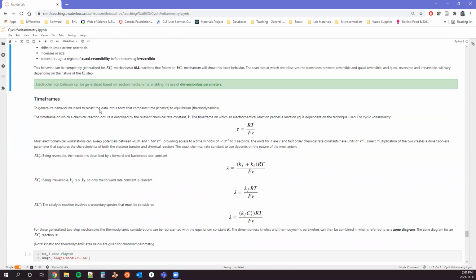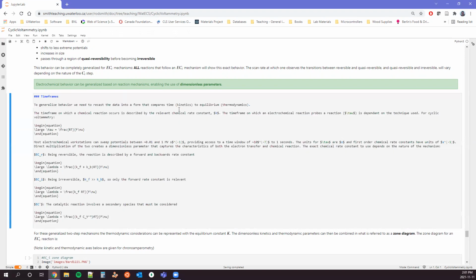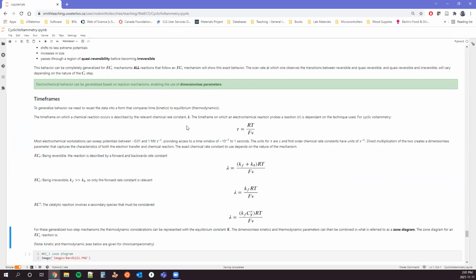In order to do that, we have to combine kinetics and thermodynamics, right? And so we need to consider the relative kinetics of the electron transfer and everything else that's happening in the system, and the relative thermodynamics of the electron transfer combined with everything else in the system as well, right? And so we're looking at time versus equilibrium, basically. And so for electrochemistry, we're going to define this tau parameter. It changes based on technique. For cyclic voltammetry, it's based on your scan rate. And so RT over F times your scan rate.